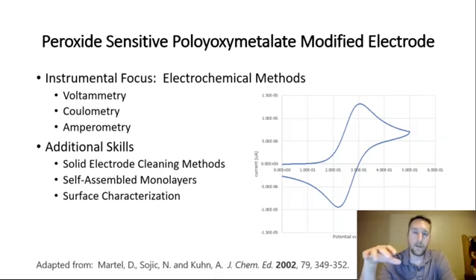Now, I have to be honest here. Because we ran out of time and we had a week where we had to cancel lab because of weather, we weren't able to do the peroxide piece of this, but I have done that peroxide piece in many years prior to this year, and it works great. So moving forward, one of the things that I would like to be able to do with this experiment is to tie it to a peroxide-generating enzyme, for example, and then follow the activity of that enzyme.